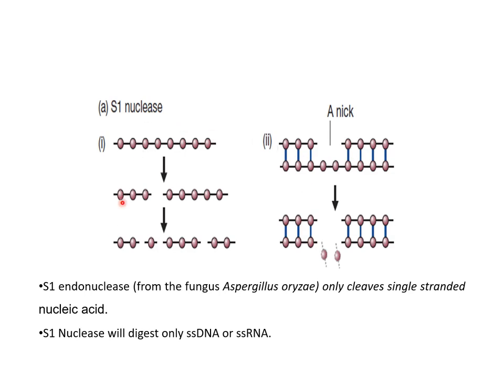S1 nuclease is an endonuclease from the fungus Aspergillus oryzae, which cleaves single-stranded nucleic acid. You can see here a nucleic acid which is single-stranded, and it gets cleaved when you treat it with S1 nuclease. So it will cleave single-stranded DNA or RNA.